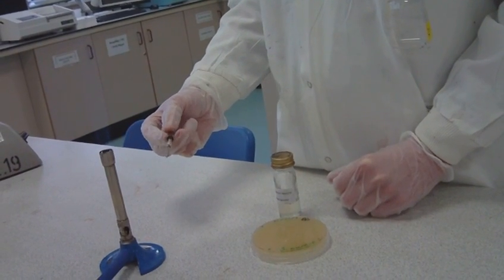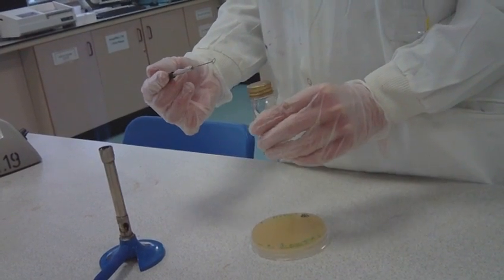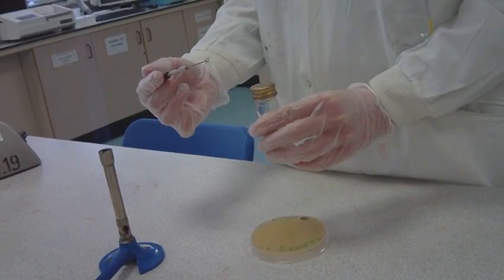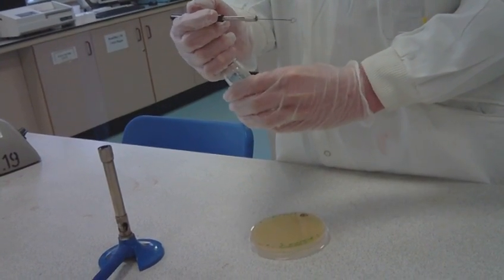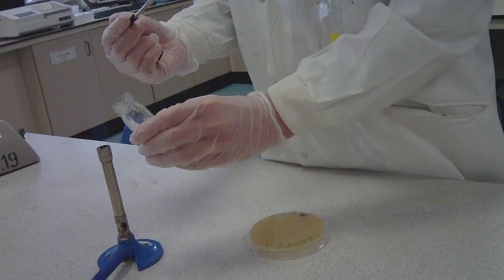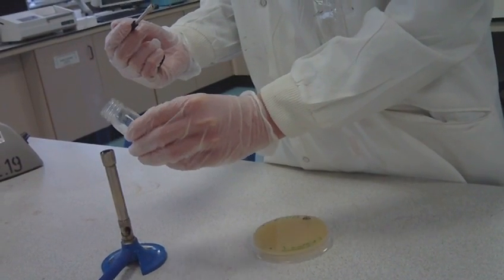Without putting the loop down, lift the test tube containing the inoculum with your left hand. Remove the cap of the bottle with the little finger of your right hand. Pass the neck of the bottle through the flame three or four times so it becomes sterile.